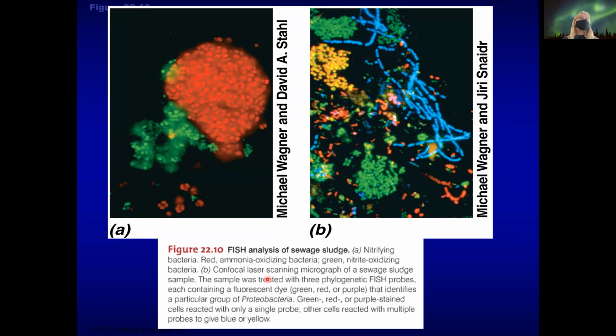We have a confocal microscope down on the first floor in our building that can do these kinds of experiments. One of the nice things about the confocal is that, if you do it right, you can keep your cells alive and watch what they're doing over time. So it's a very powerful microscope technique. A couple of my grad students have used it for some of their questions when they were looking at their microbes.